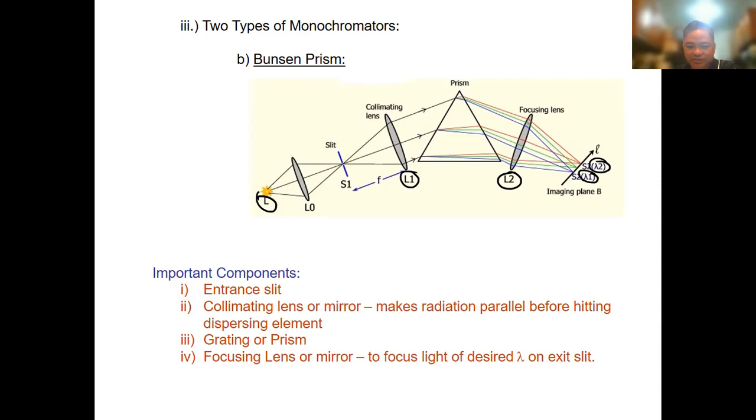So, dito parang titirahin ng collimating lens, daan tayo dito, daan tayo dito, daan tayo dito, and all of them will give you different wavelength and the focusing length until it will just release in the exit slit the wavelength that you're looking for.